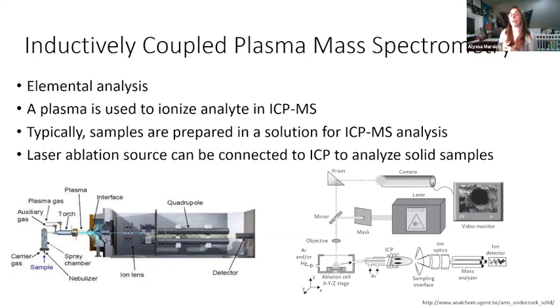It uses a fourth state of matter, right? So we have gas, liquid, solid. There's actually more states of matter than that. So somebody lied to you in high school. Plasma is actually a fourth state of matter. And the best way to describe plasma, it's almost like a jelly-like material. But it's a gas phase jelly material, if that kind of makes sense.